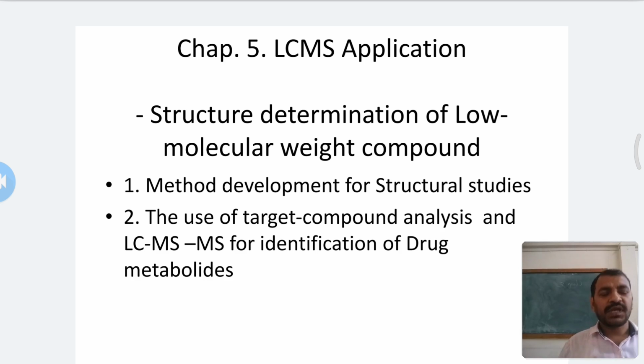So today we are discussing chapter 5, LCMS application. In this chapter we discuss structure determination of low molecular weight compounds.